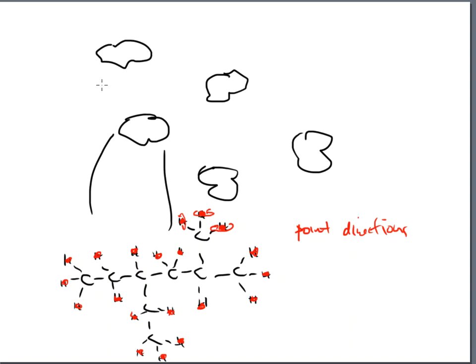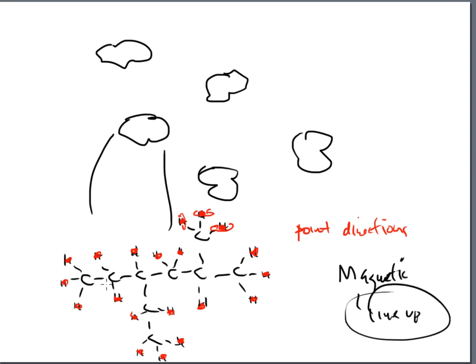So, one of the first things that we do in NMR is put the M in NMR. We put a magnet onto this molecule. And by putting a magnet that has a very strong magnetic field, attention! That's what happens to all of the protons. Oh, I see. We can put order to the chaos. The magnet will make all of these protons line up all in a row.